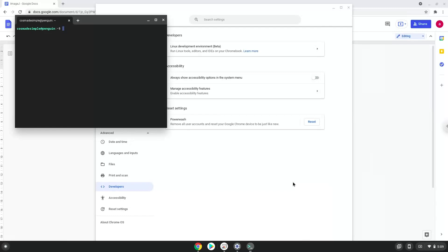Now that we have enabled Linux apps on our system, we will continue to the next step, which is to run several commands in a terminal, which will install image. All the commands are in the video description.